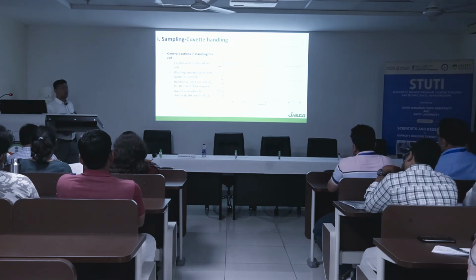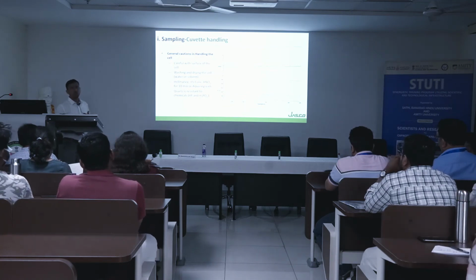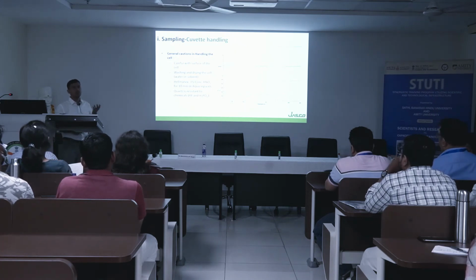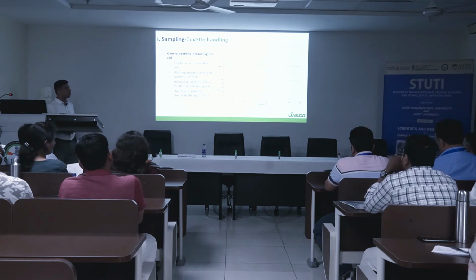So initially, if your sample is water, when you use the baseline correction, it should give a zero dichroism, right? If your water sample gives a dichroism signal, or maybe your cuvette is contaminated, you should check before analyzing. The HT voltage should be minimal, it should not be high. It should not be giving absorptions like this.